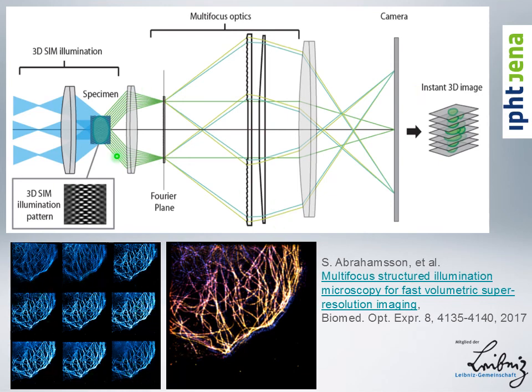And of course, altogether, we then need to take only our 9 images, for example, and get a whole stack reconstructed in one go. You see that the correction optics is fairly complicated: it is another grating that compensates for the chromatic aberrations, together with a prism that is a structured prism plane, and together with the lenses they form something like this.